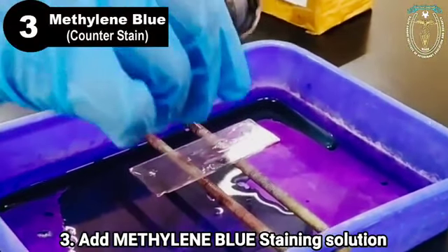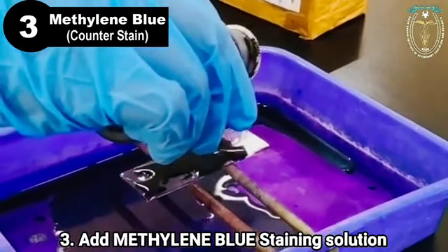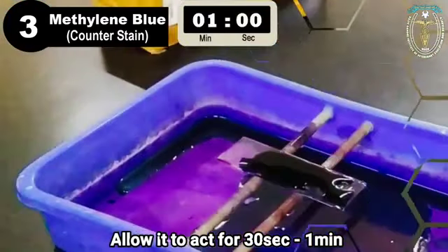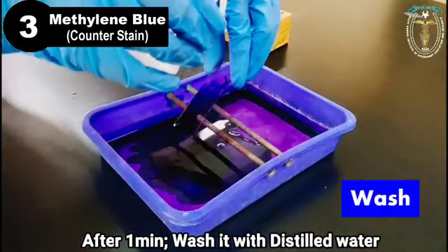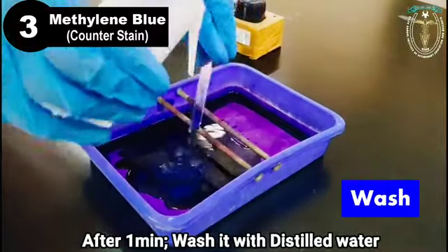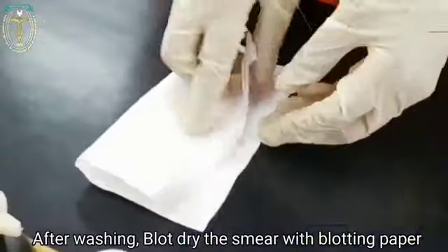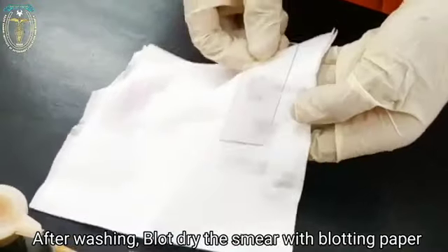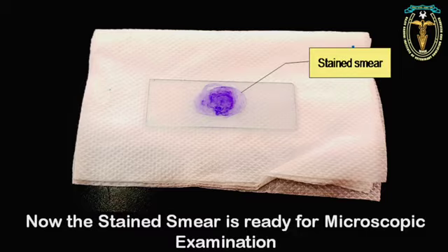Lastly, add the Loeffler's methylene blue staining solution over the smear. Cover the entire smear with the staining solution, and allow it to stand for 30 seconds to 1 minute. After 30 seconds to 1 minute, wash it with distilled water. After washing, blot dry the smear using the blotting paper. Now, the stained smear is ready for microscopic examination.